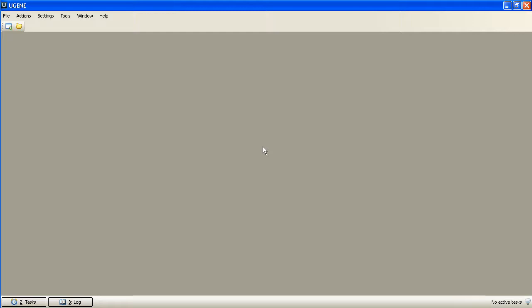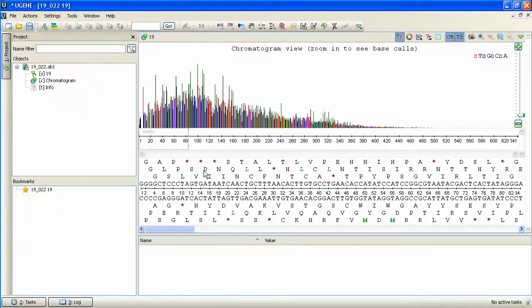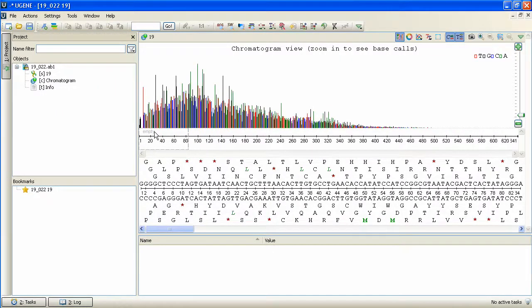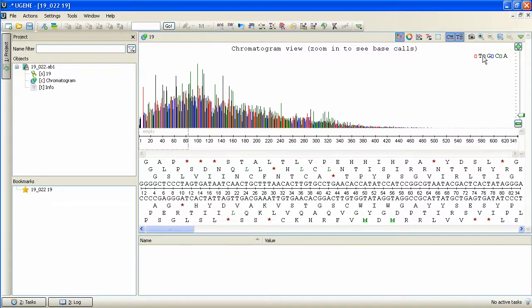To watch a chromatogram, we open one of such files, for example, this one. The opened view contains a usual sequence view and the chromatogram view. The new view contains the chromatogram, the base coloring legend, and the vertical zoom slider.